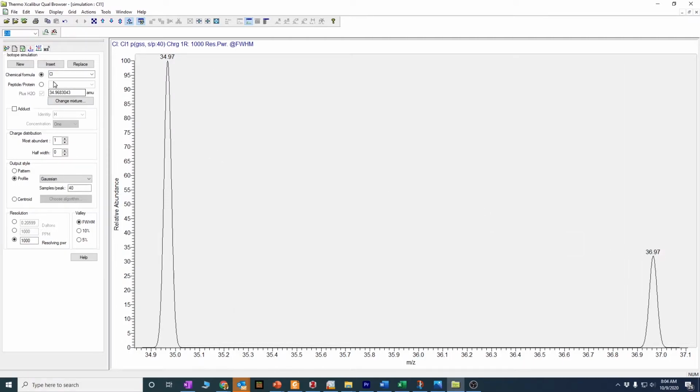So that is to say, most of the time with organic compounds, you don't have to worry a whole ton about isotope peaks. Now, the small discrepancies in isotope peaks are going to be useful for us in isotope ratio mass spectrometry, which is going to be done with thermal ionization.